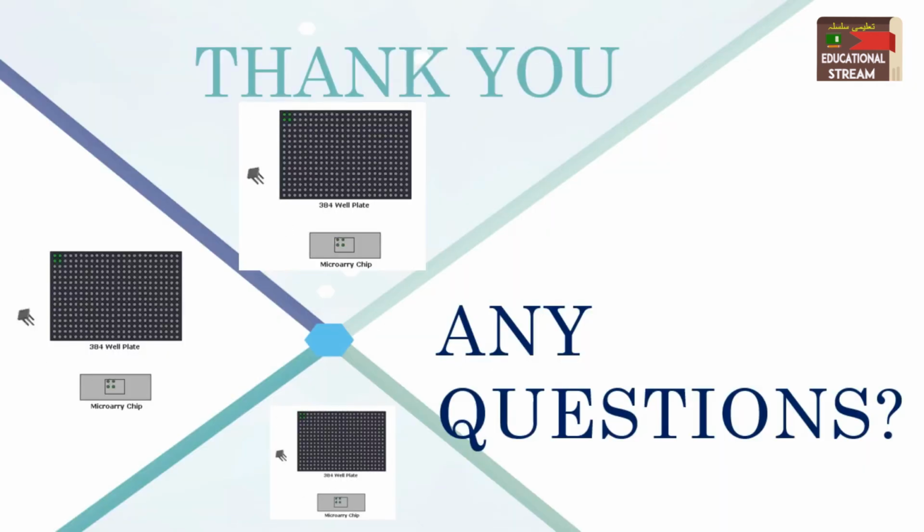So this was all about today's lecture, in which we have studied an advanced technique of DNA microarray, in which we are performing various kinds of reactions together on a simple chip, so that thousands of millions of gene expressions can be detected by using the cDNA on a single microarray chip. We have studied the requirements and the principle of DNA microarray, also discussed the types of DNA microarrays, its applications, and then we have also studied the advantages and disadvantages of DNA microarrays.